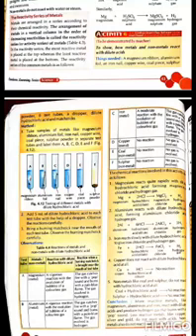To start with the experiment, take samples of metals like magnesium ribbon, aluminium foil, iron nail, copper wire, coal piece, sulfur powder in separate test tubes and label them A, B, C, D, E and F. Add 5 milliliter of dilute hydrochloric acid to each test tube with the help of a dropper.